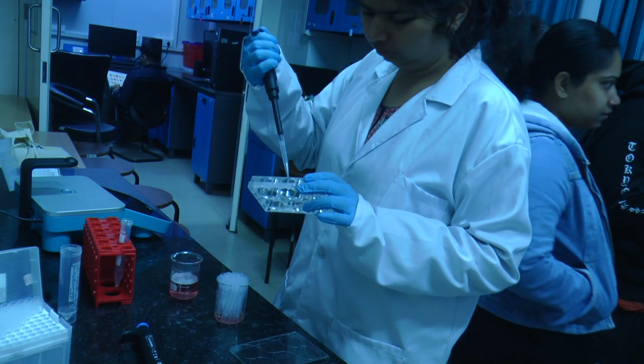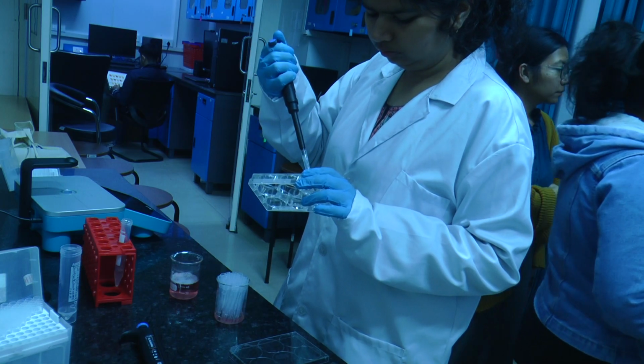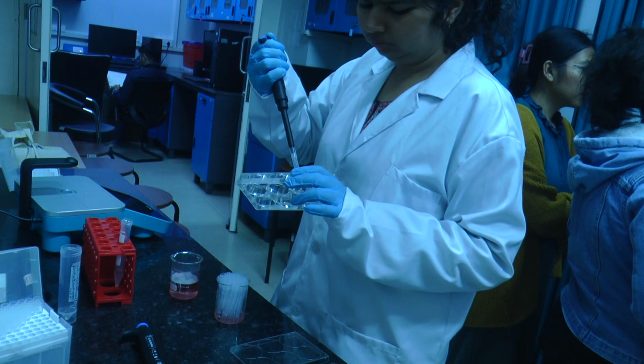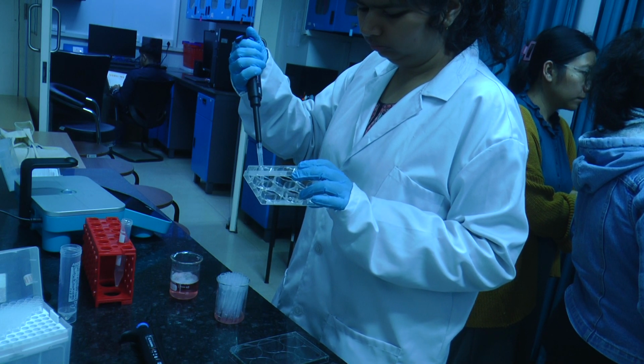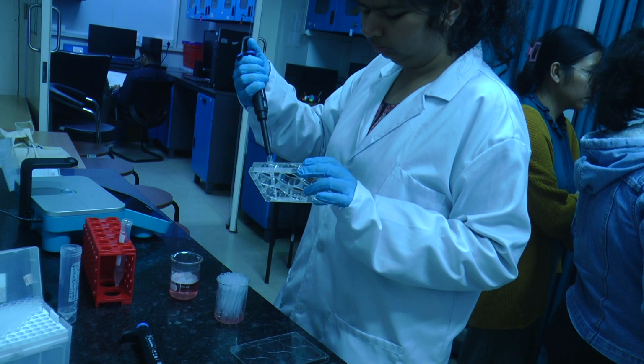So now see, we had removed the media and we have added this buffer now. So when we'll be taking the vesicles, basically outside the vesicles we'll be having this buffer, right? You agree with me? And inside, I already told you, it is taking part of cytoplasm with it.